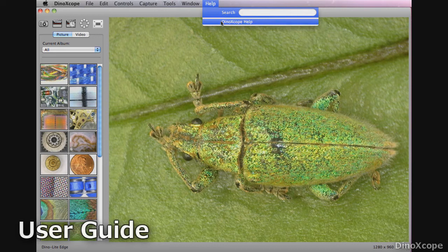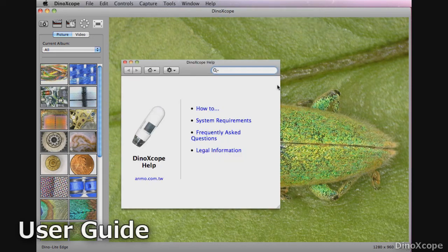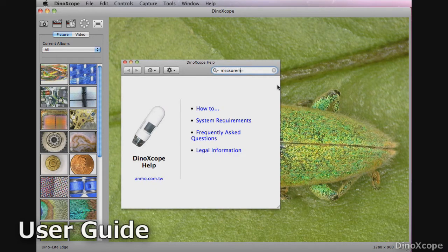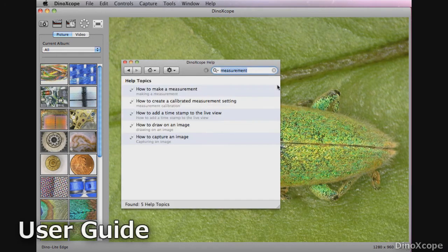The user guide found in the help menu has plenty of in-depth information as well as an easy to use search function.